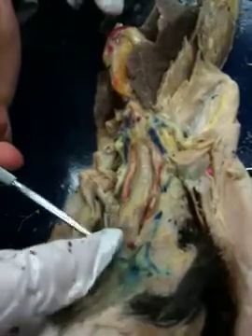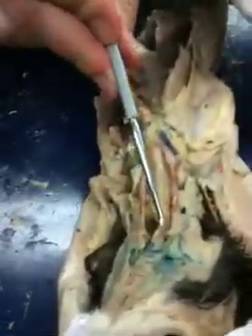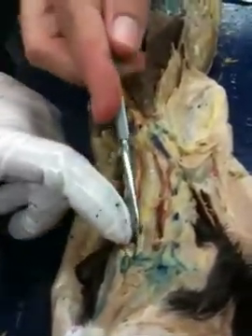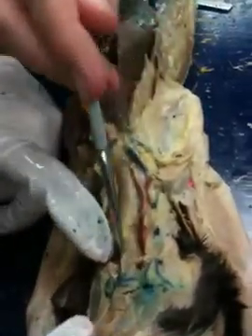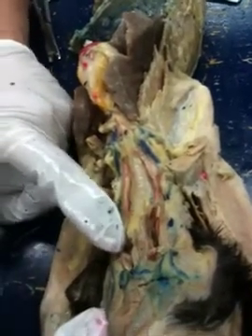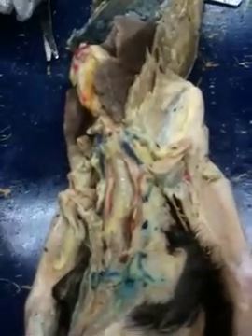Do we need to take this off or leave that? If you look in there, you've already cut a little higher. But if you look, there's a little flap on the upper edge here coming down. I see it, yeah. That's your epiglottis. Okay, so it hangs down? No, it's actually up most of the time. And then when you swallow, it goes down and it covers up the larynx.